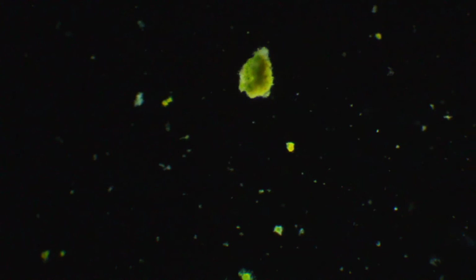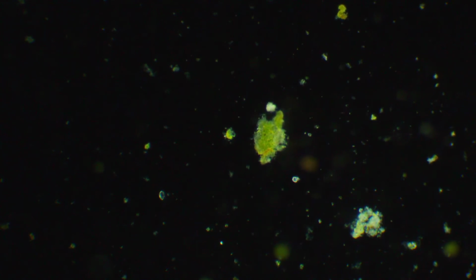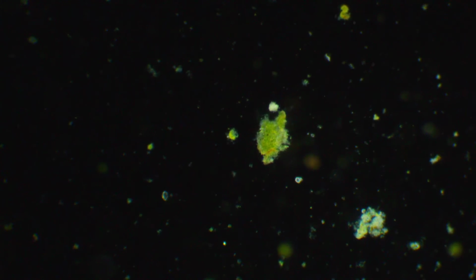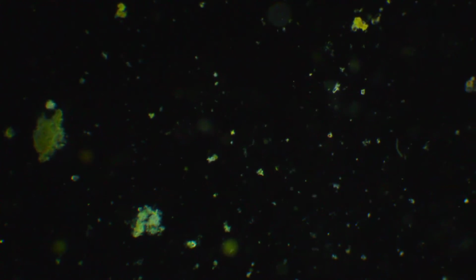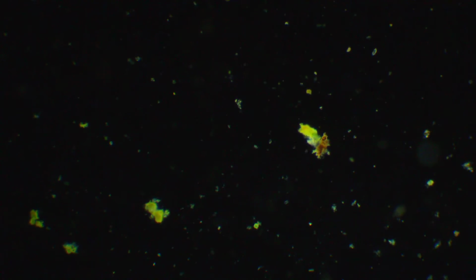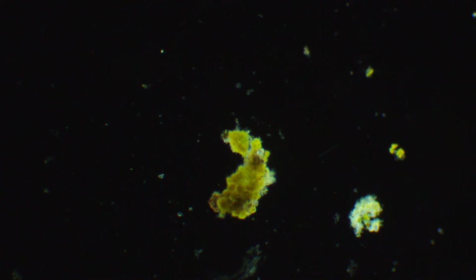And it wasn't just a lump of plant cells like this algae we're looking at. It was a very, very structured individual plant that was propelling itself through the water. Fascinating stuff. I had no idea that even... That just blows my mind. Didn't know that existed. So I'm looking for those. They seem to be pretty rare. I only saw one so far.